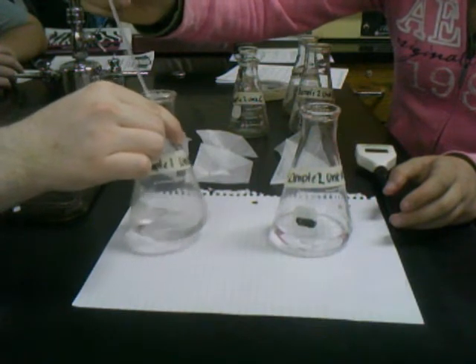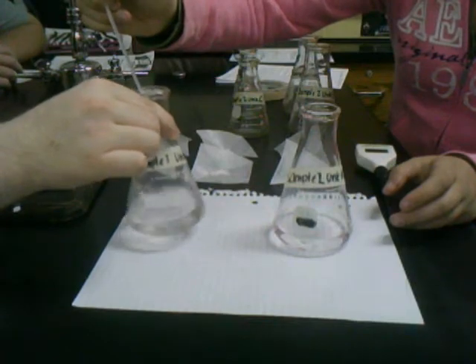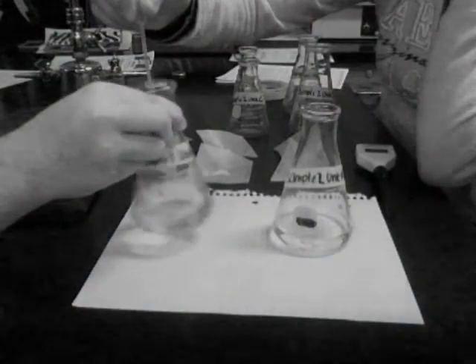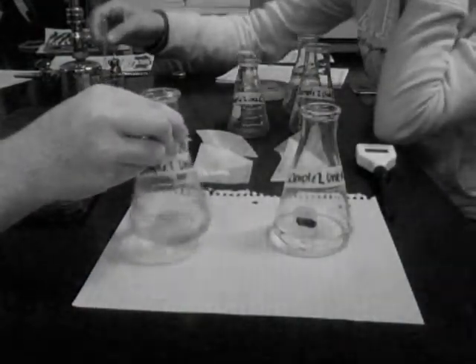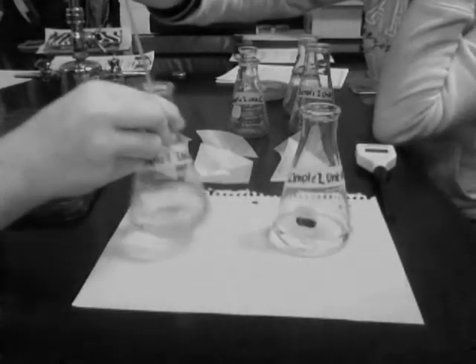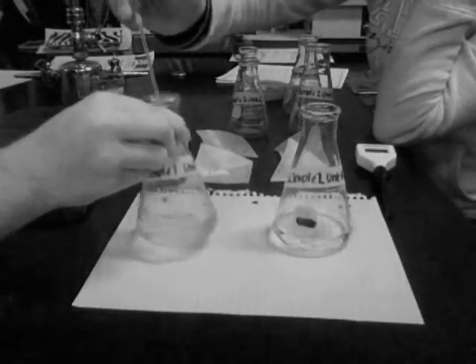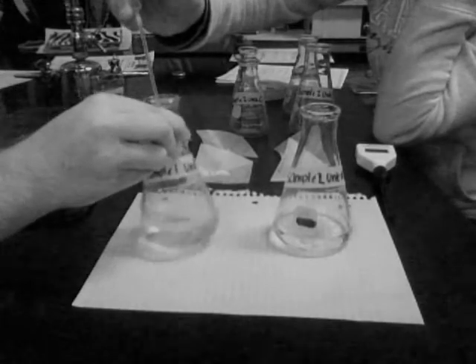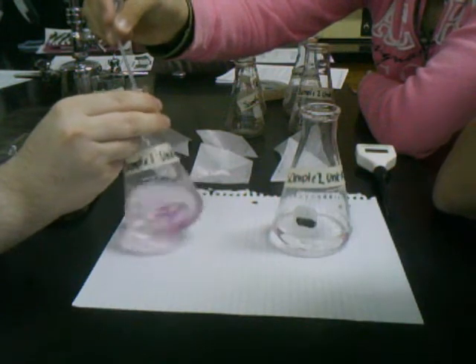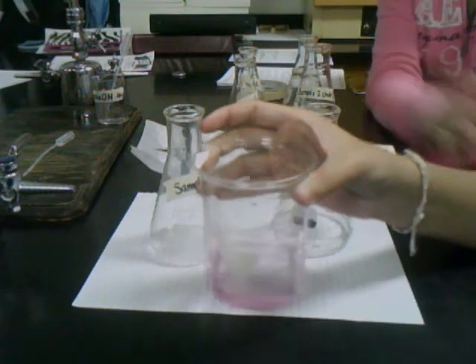I don't know if you can see this on the camera, but it's turning a slight pink color every time I add the hydroxide. The pink is beginning to stay a little longer with each drop. I'm going to continue adding and we'll keep swirling to make sure it's thoroughly mixed.